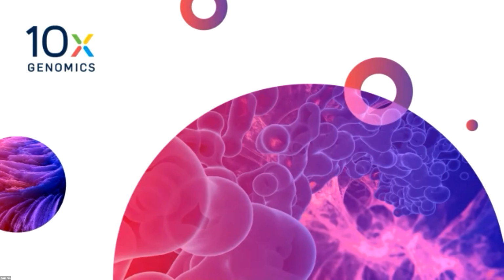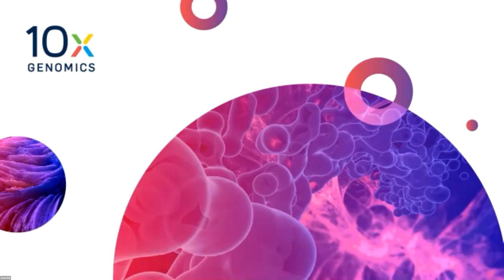But presumably when you say which cores have facilities, what we're talking about is a fairly conventional histopathology facility and a sequencing facility. That's correct. And when you boil it down, some are offering them as kind of a concierge to have the logistics taken care of. But yes, you have histology access or microscopy access. You really don't need a facility to necessarily do it.